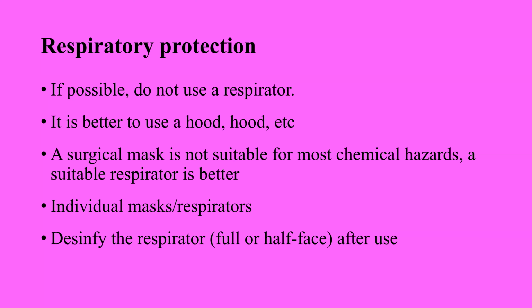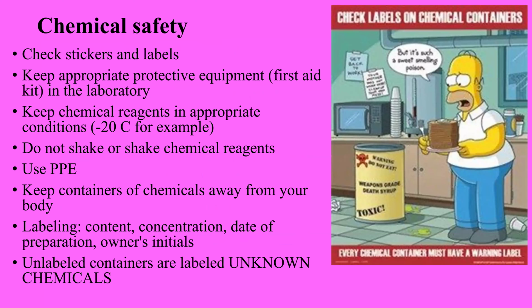Thanks to the COVID pandemic, we have a lot of respirators in this time. All labs are full of these respirators, and they are very useful for protecting the respiratory tract from acids or other chemical hazards. But the next problem is that we should disinfect these respirators after use.